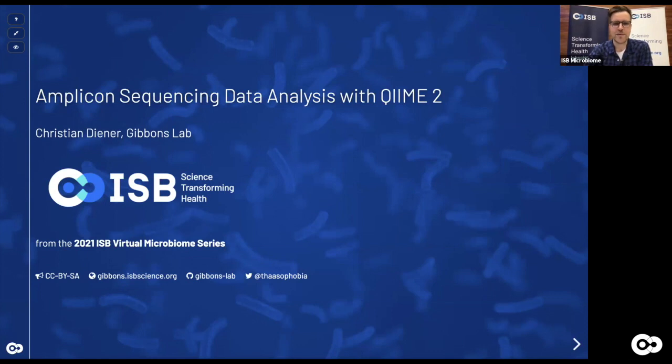And like I said, today we'll be looking at how to analyze community data from Amplicon sequencing data. And tomorrow we'll be looking a little bit more at bacterial isolate sequencing and how we can generate some functional insights from that.